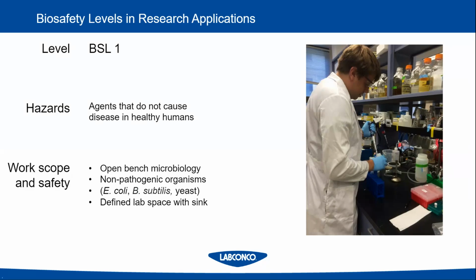So BSL 1 labs, the lowest biosafety level, are labs and environments that work with biohazards that don't cause disease in healthy humans. This would be common research organisms like E. coli, Bacillus subtilis, yeast, things like that that are not hazardous or pathogenic at all.